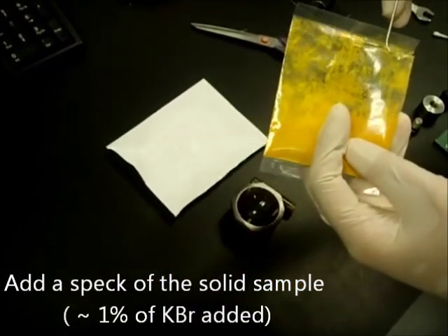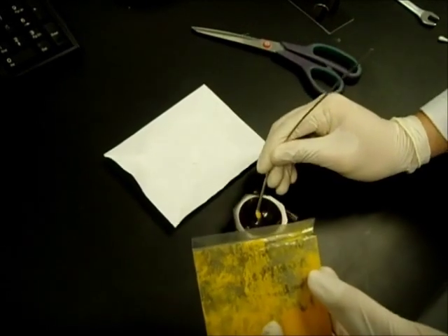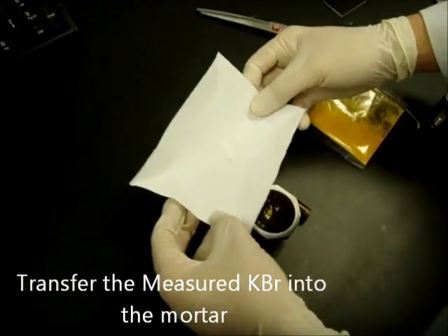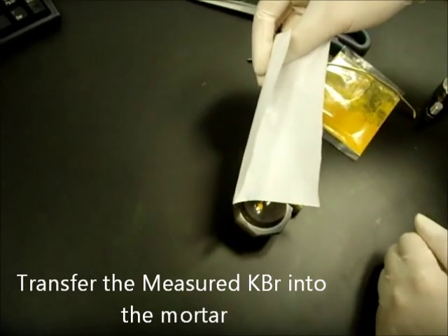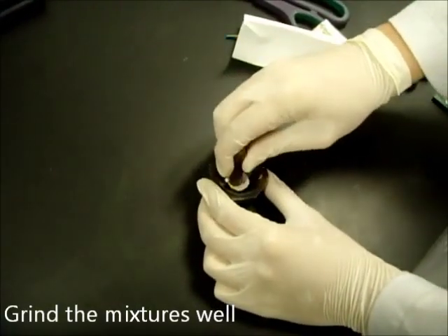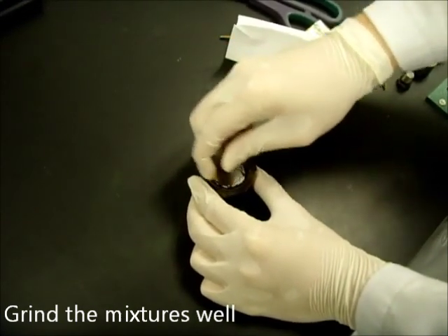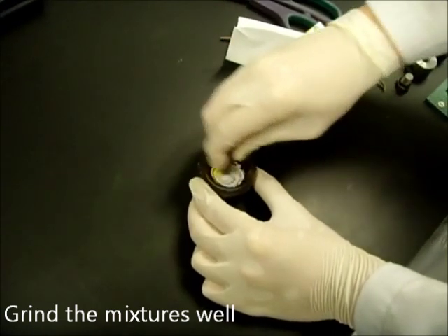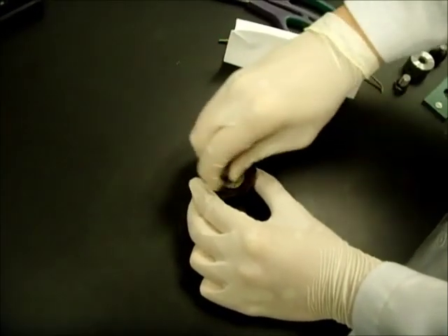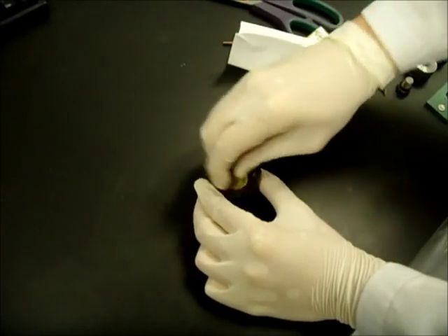Don't add too much sample, because it will cause oversaturation. Grind it well using the pestle. You may have to do it for a minute or two. Now you'll see that you have a homogeneous mix.